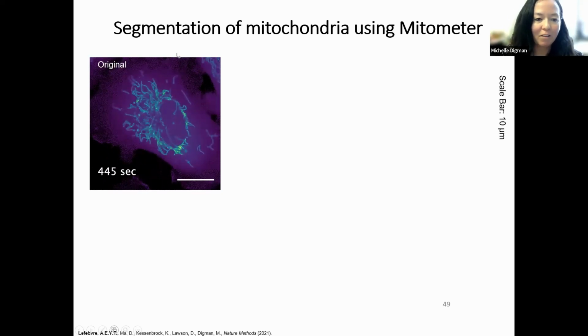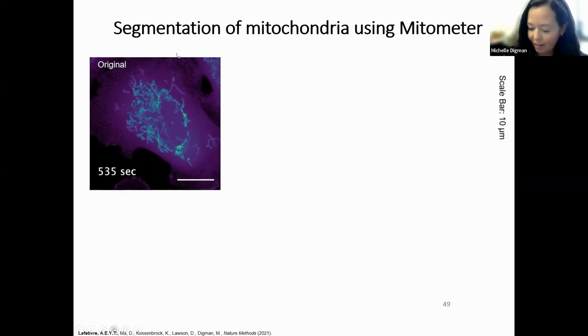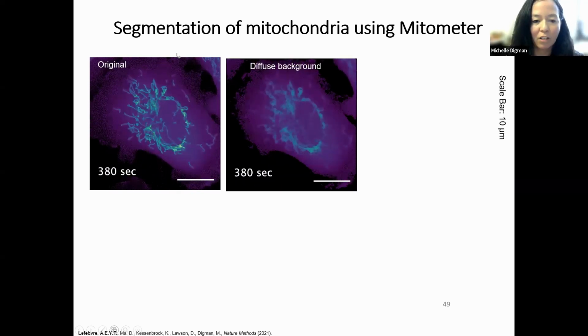We were imaging mitochondria, and we had a lot of issues. First of all, there's not a lot of image software to track mitochondria. But you also get these fuzzy looking images, as well as mitochondria that overlap, or mitochondria that are not so visible in certain regions of the cell when you're doing a good cross section.